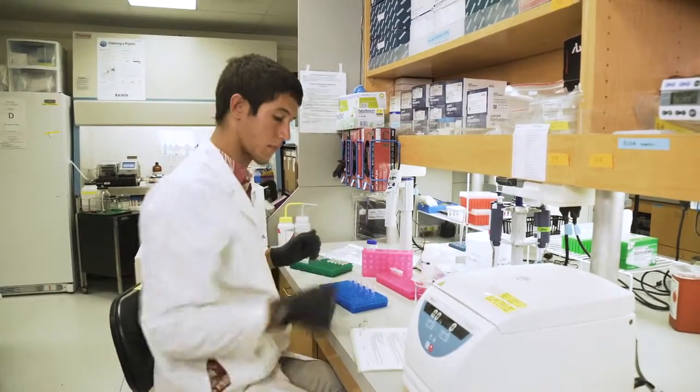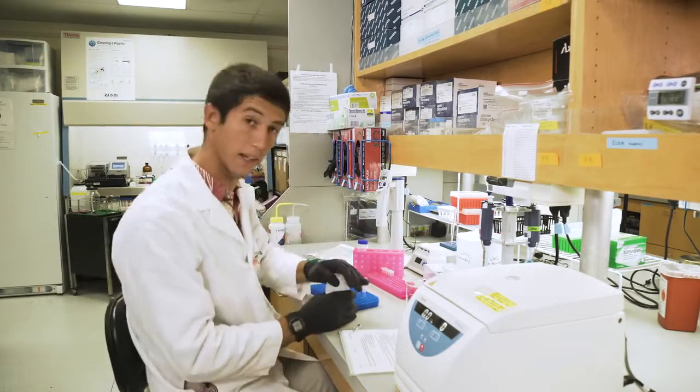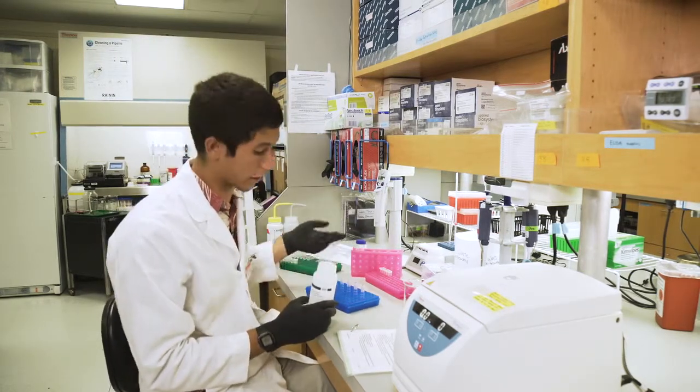And we move on to our next wash buffer. So, like I said, we're cleaning off the DNA, and so we're going to add 500 microliters of this into each column, and then we're going to centrifuge it again.